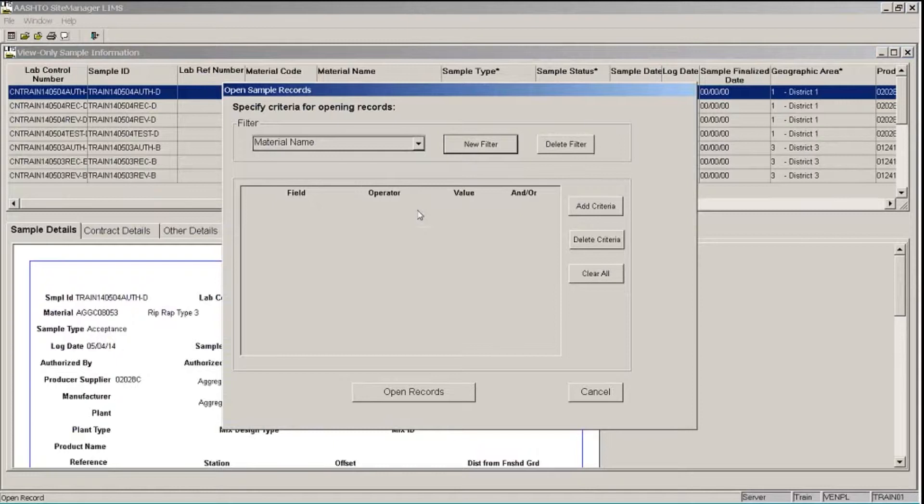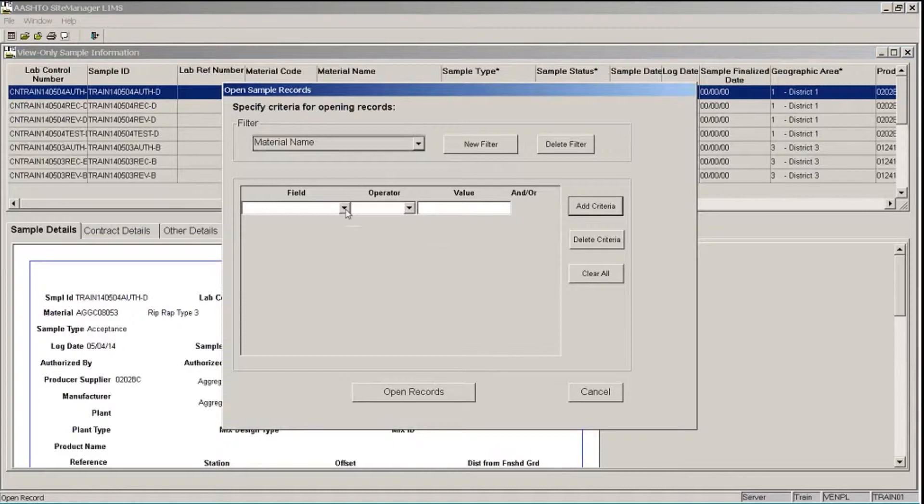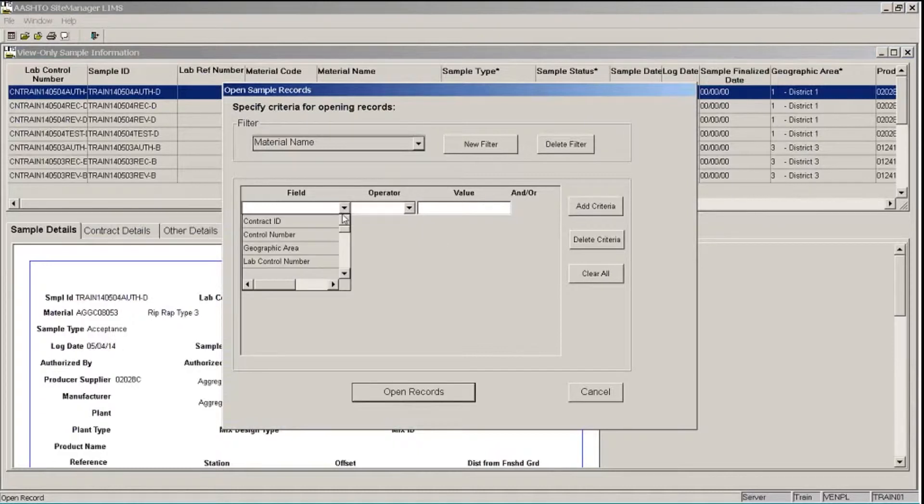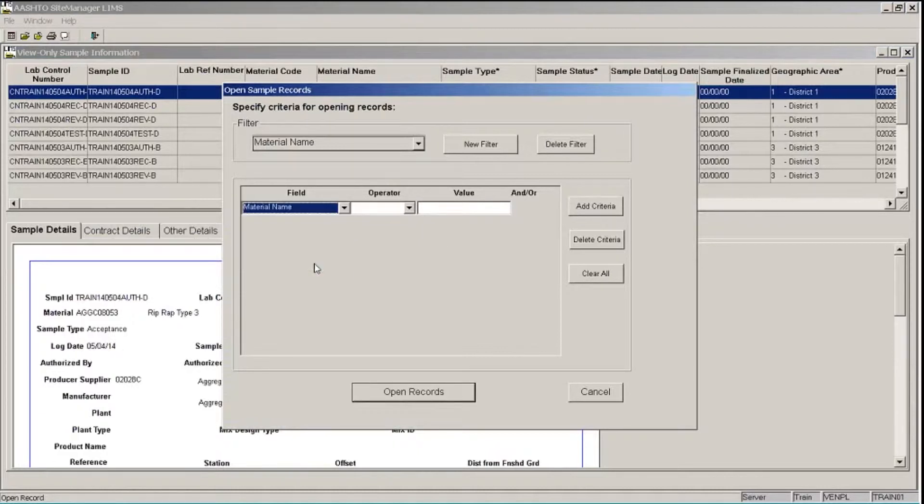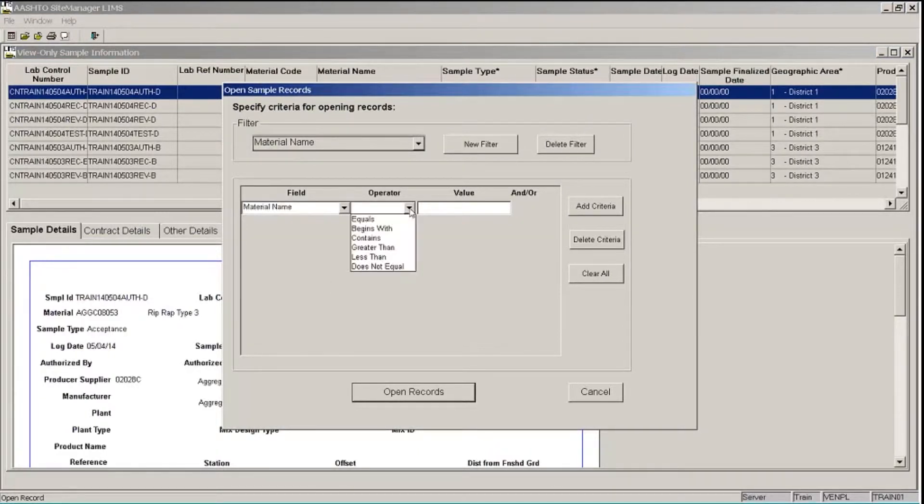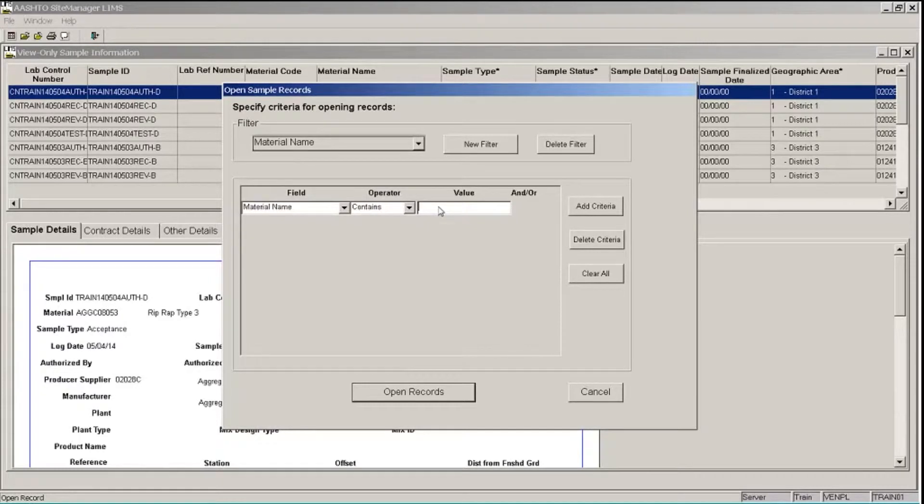And so now we can add our criteria for our new filter. Click the Add Criteria button. And in my field drop-down list, I'm going to scroll down and choose Material Name. The operator will be Contains. And the value, I'm going to type SAND. Now notice I did not type SAND in all caps this time, because in our code tables, the Material Name field is in mixed case. So this is going to look for all the records that have a Material Name with SAND spelled this way.